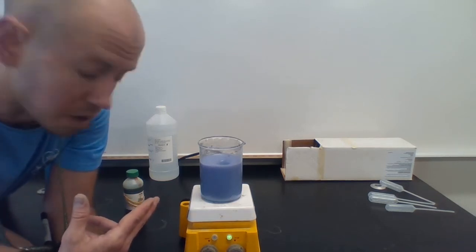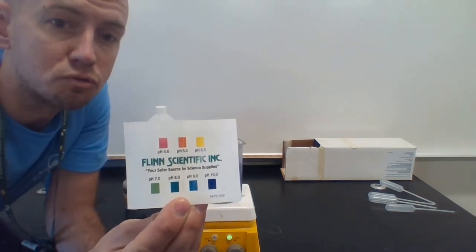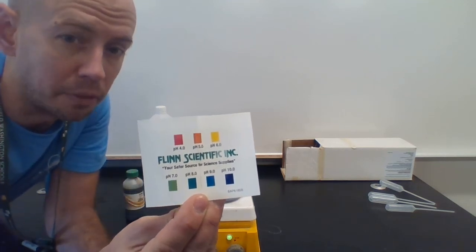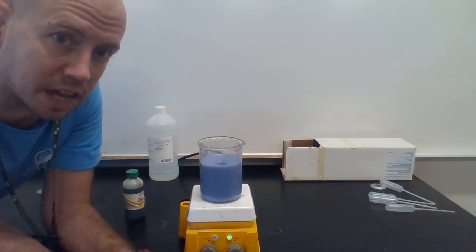In there is also an acid base indicator, universal indicator, and we've got a color chart that goes along with that. When it's red or orange, that tells me I have an acid in there. When it's blue and purple, that tells me I have a base. And right now it is purple because we only have magnesium hydroxide in there.